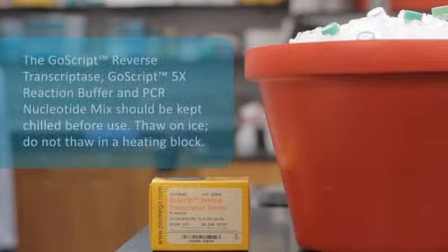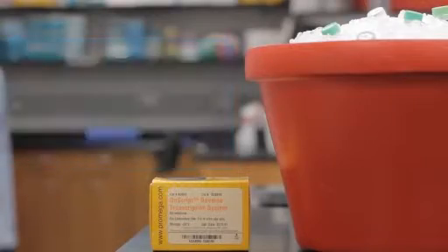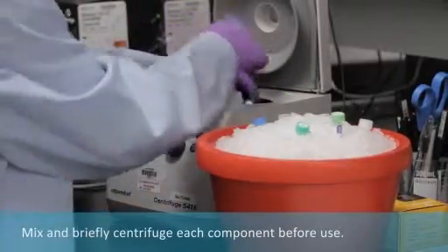Thaw the GoScript Reverse Transcriptase, GoScript 5X Reaction Buffer, and PCR nucleotide mix on ice. Do not thaw in a heating block. These components should be kept on ice before use. Mix and briefly centrifuge each component.